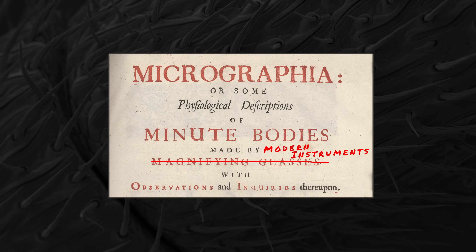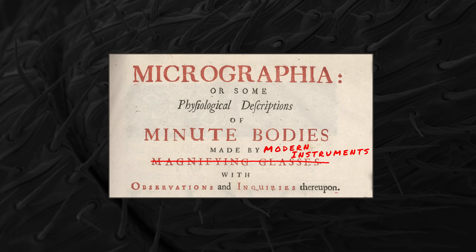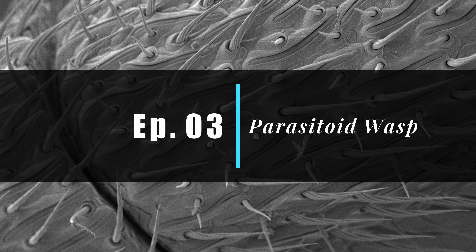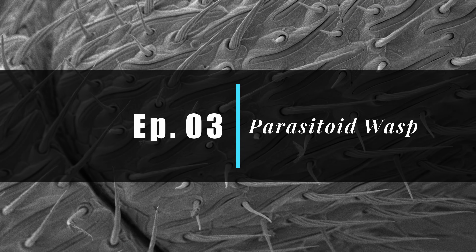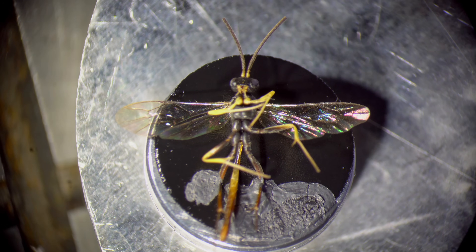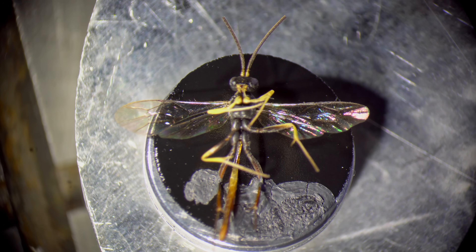Hello and welcome to Micrographia, an exploration of everyday items at the micro and nano scale. Today, we're looking at this tiny wasp.